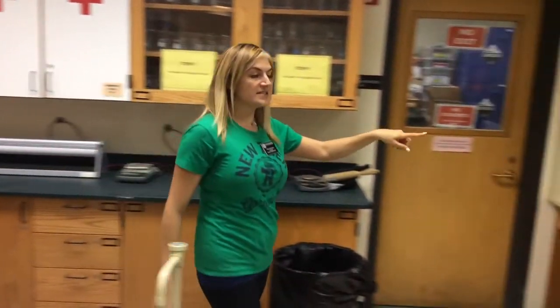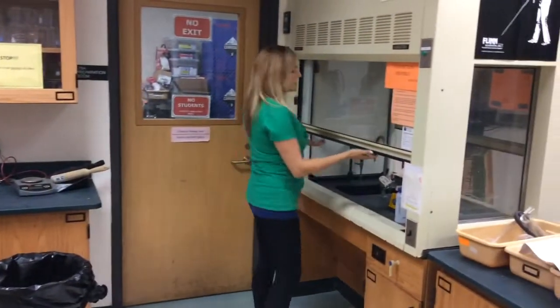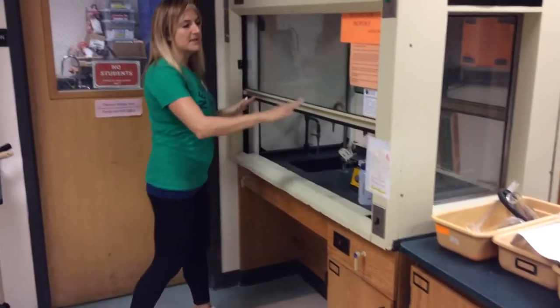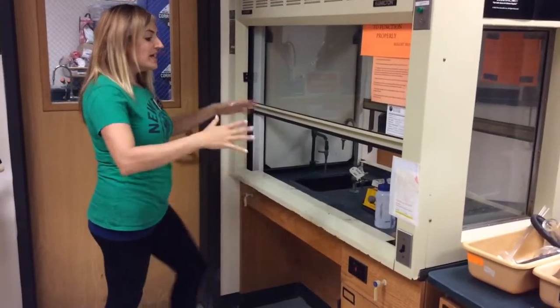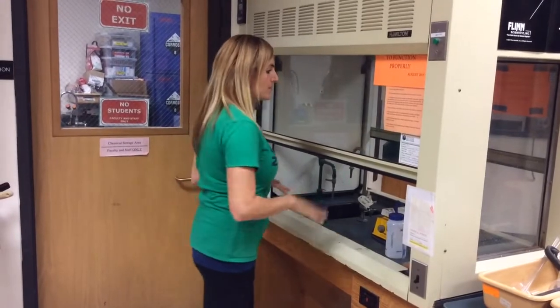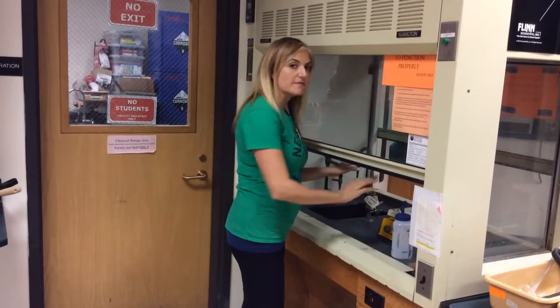Okay, over here, this is called the hood. This is the sash to the hood. You can raise it up or down. It usually stays about mid-level. Here's where you'll do a lot of stuff that releases maybe a fume or a chemical or some gas that could be a little bit more detrimental to you. So always remember to keep the shield in front of your face.